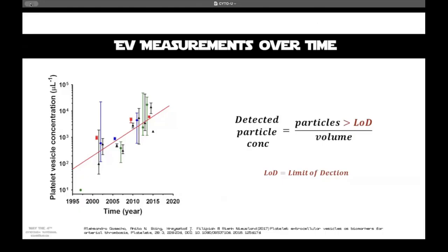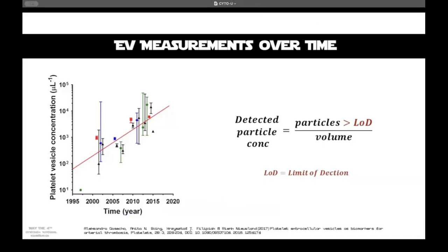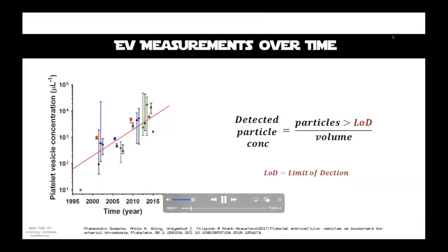Really what we should be talking about is the particle concentration detected above a set limit of detection. In this way, we would have reproducible measurements over time, irrespective of the sensitivity changes that are inevitably going to occur as technology advances.